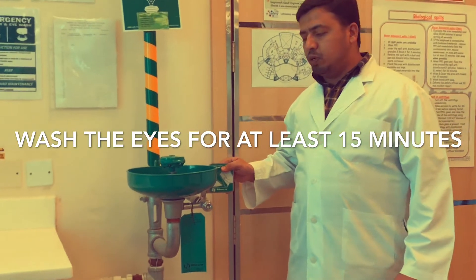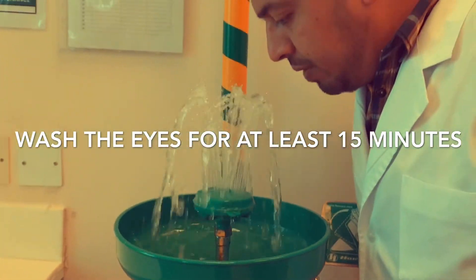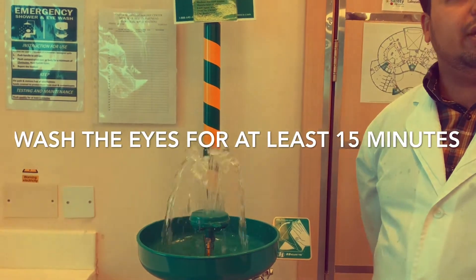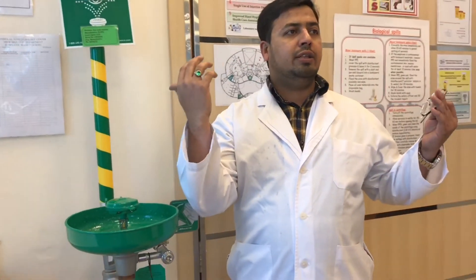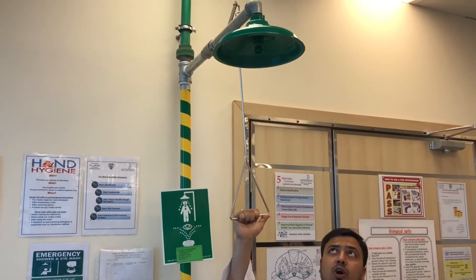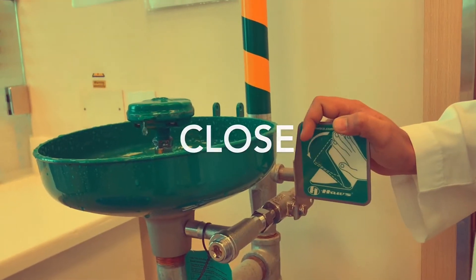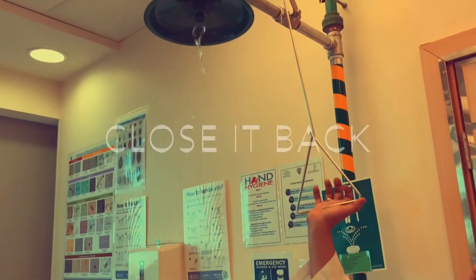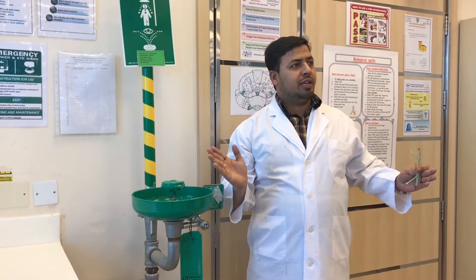Push this knob and, according to the water pressure, bend your face and wash your eyes for at least 15 minutes. That is for the eyewash. Whenever a chemical or any other spill gets on our body, we need to come here and pull this knob downwards. Let's try this one by one.